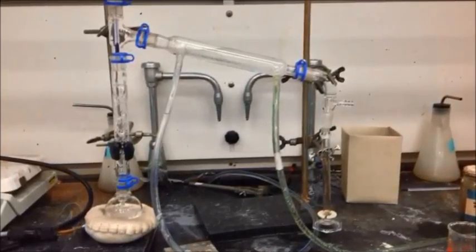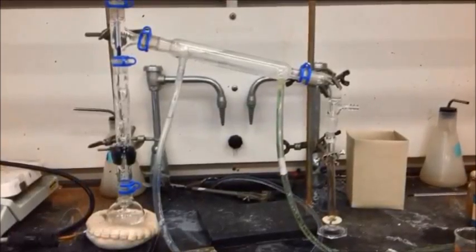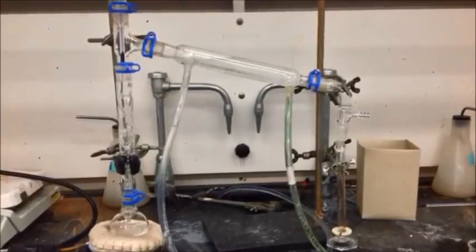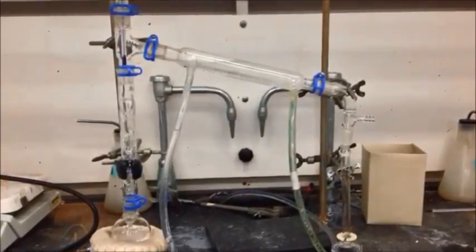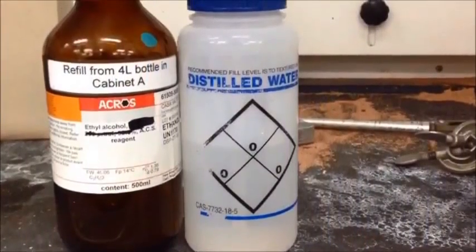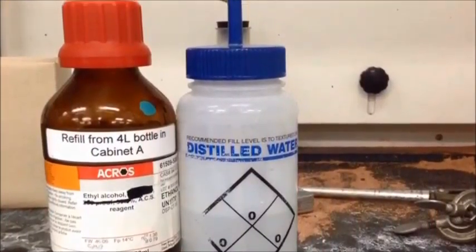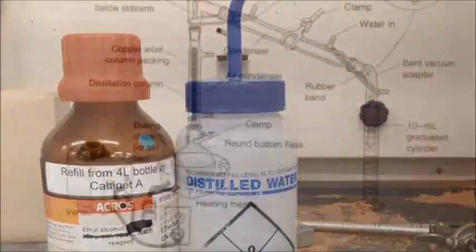Fractional distillation is a method of separation using boiling points. The substance that has the lower boiling point will be able to boil off and be collected, separate from the substance with the higher boiling point. Today we will be using a mixture of water with a boiling point of 100 degrees Celsius and ethanol, which has a boiling point of about 78 degrees Celsius.